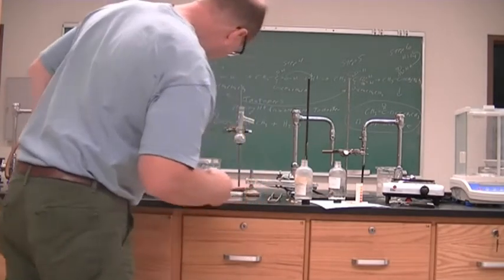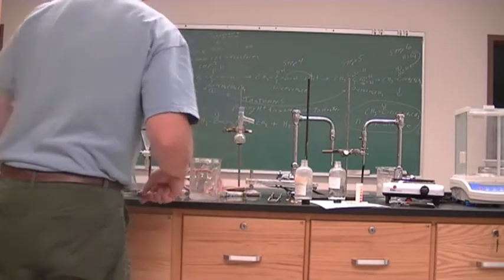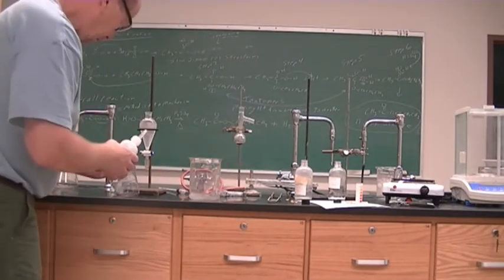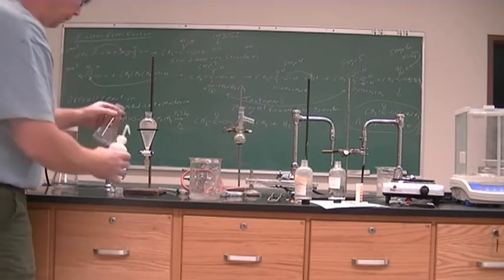Alright, now hopefully all that solid sodium carbonate doesn't clog up the separatory funnel. Probably should have decanted.